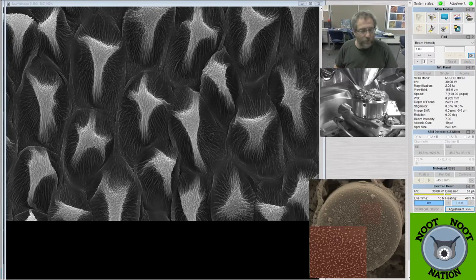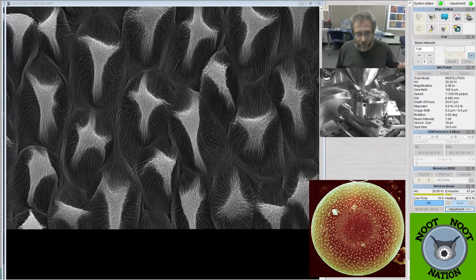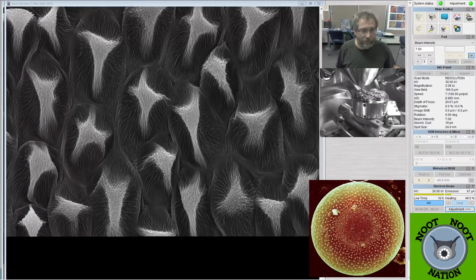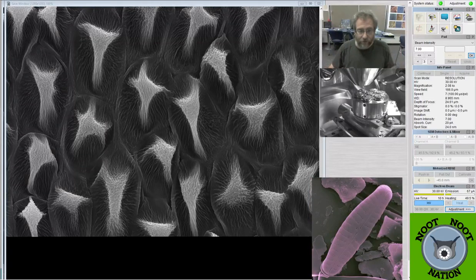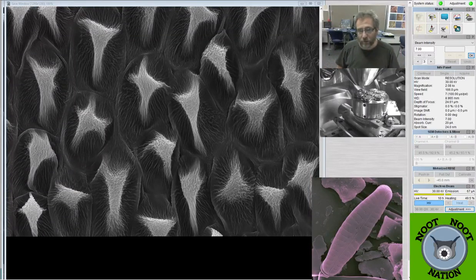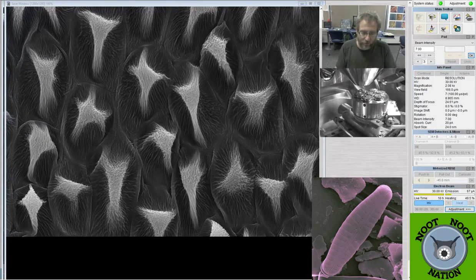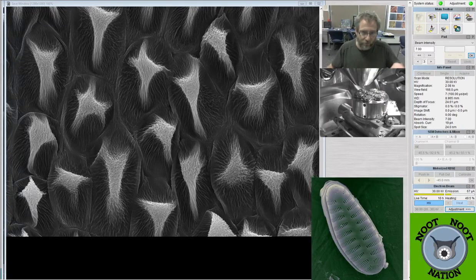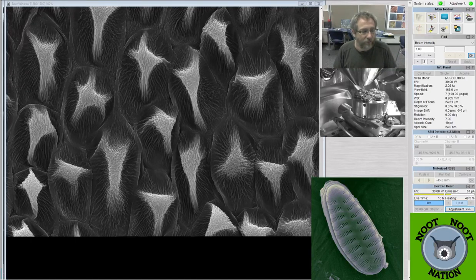I labeled which ones were which, and then I stuffed it in the sputter coater, which is over there, turned it on, and coated them with a fine layer of gold deposition, which is basically something that you have to have in order to allow the specimens to be conductive. We want them to be conductive because I'm going to hit them with electrons, and I don't want it to build up in areas where there's peaks or edges. So I want them to kind of roll off of the surface if it's not bouncing back at me.